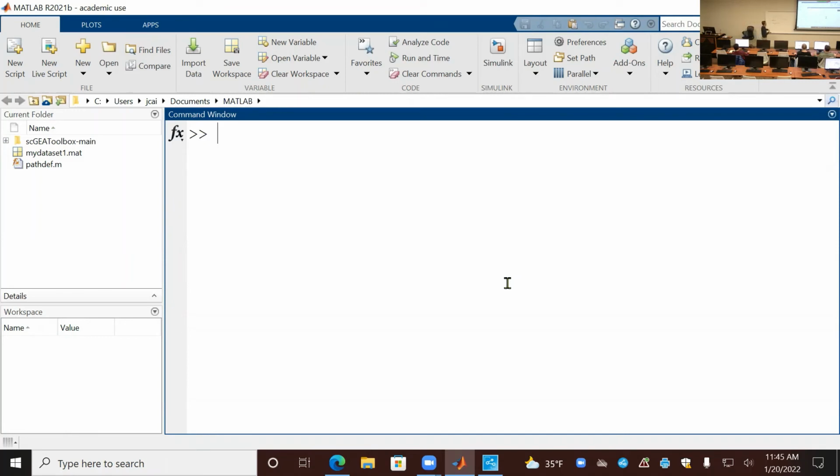My data set has been saved into my working folder currently. That's that file, so that's in there. So how can we load it back? Just type load my data file.